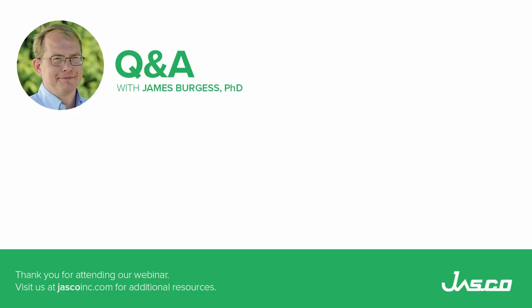Well, there are several questions asking about the Z scans, and I just want to make the difference between the two instruments, Raman microscopy and the FTIR microscope. Last week I was presenting about the Raman, and Raman is a confocal technique, so we can do the mapping in the Z direction, so we can have a 3D image and 3D mapping. That is not the case for the FTIR microscope. I'm just answering that because there are 3 or 4 questions about the same.